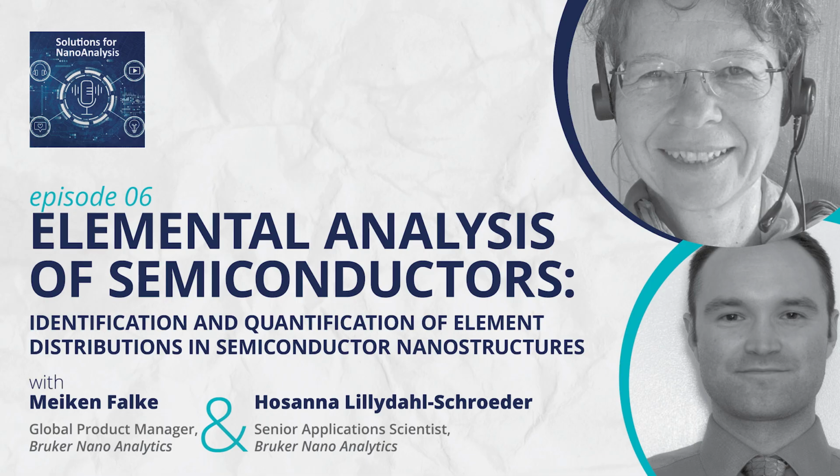Yeah. So just to repeat, I already mentioned the III-V mixtures, which are really difficult for EELS, mixes of many elements, and finding residuals of manufacturing and preparation. Also the gallium and platinum from the FIB can be seen in EDS, by the way. Particularly challenging are perceived the overlaps of, for instance, hafnium, tungsten and silicon, or the overlap of copper and tantalum.